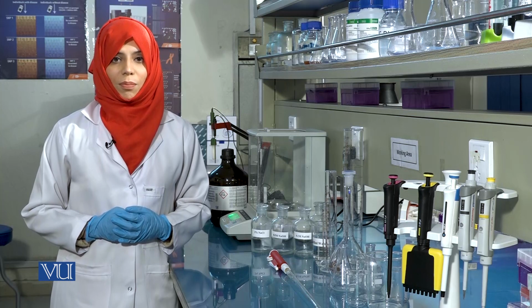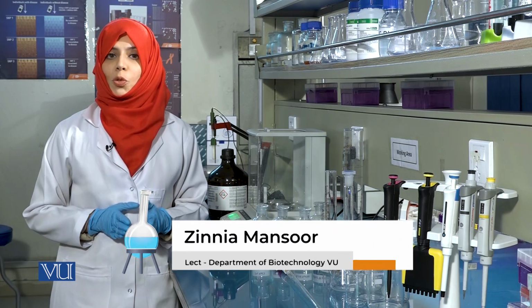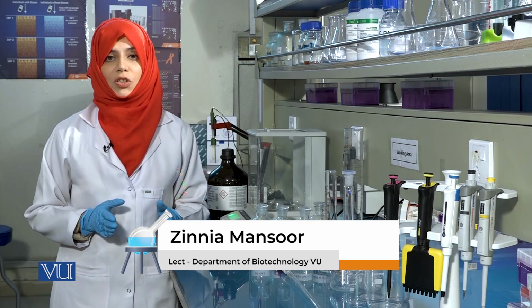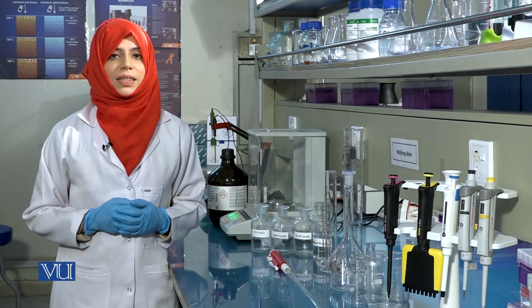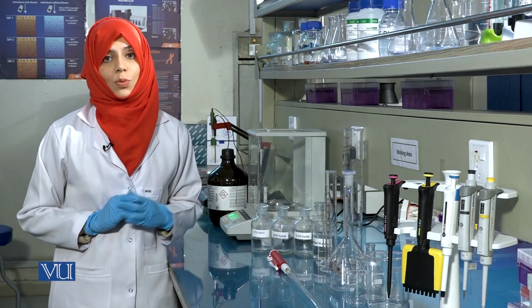Dear students, most of the reagents used in the scientific laboratory are in the form of solutions that need to be prepared or purchased. For some cases, the exact concentration of the solution is not important, while for other cases, the concentration and the method of preparation of the solution need to be as accurate as possible. Today, we will learn how to make solutions in the laboratory. But before that, we need to get acquainted with the glassware used for this purpose.